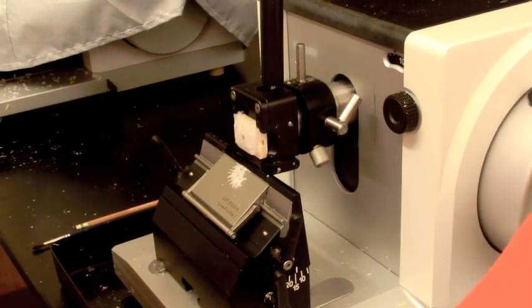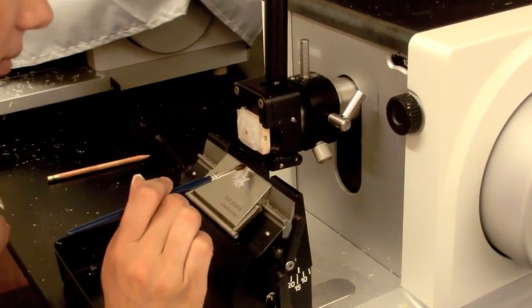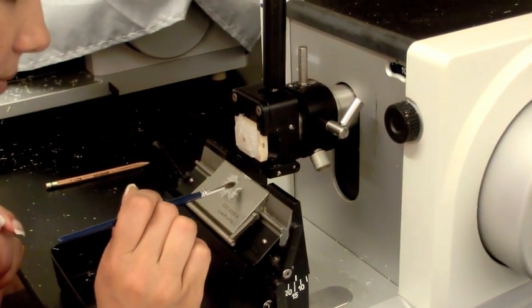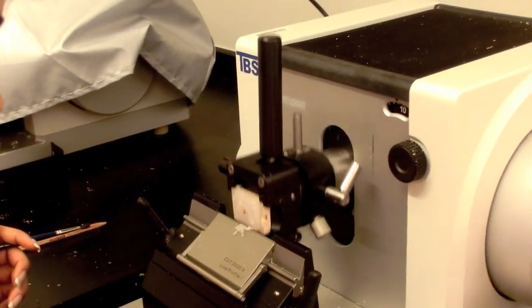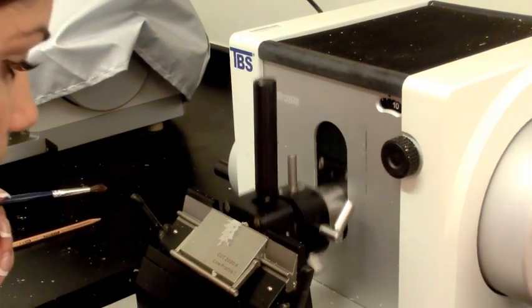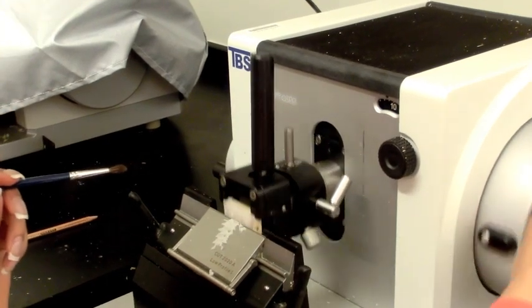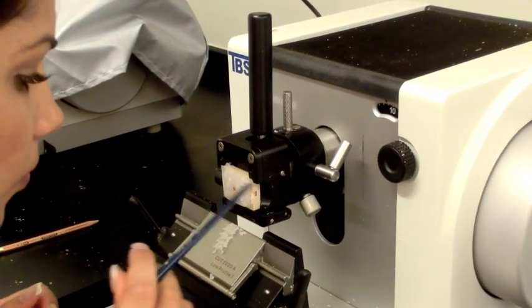As you begin to cut into the paraffin specimen, discard all unwanted sections using a paintbrush. Be careful not to drag the brush across the blade. Continue turning the wheel until you obtain a desired section. Once you have done so, make a ribbon that contains multiple sections of your tissue.